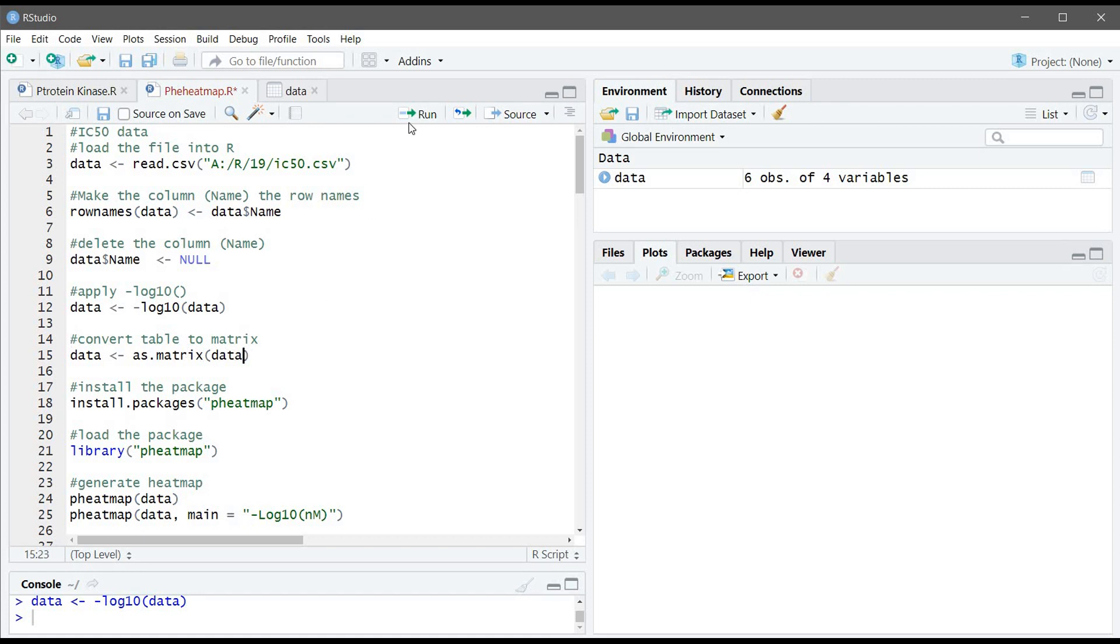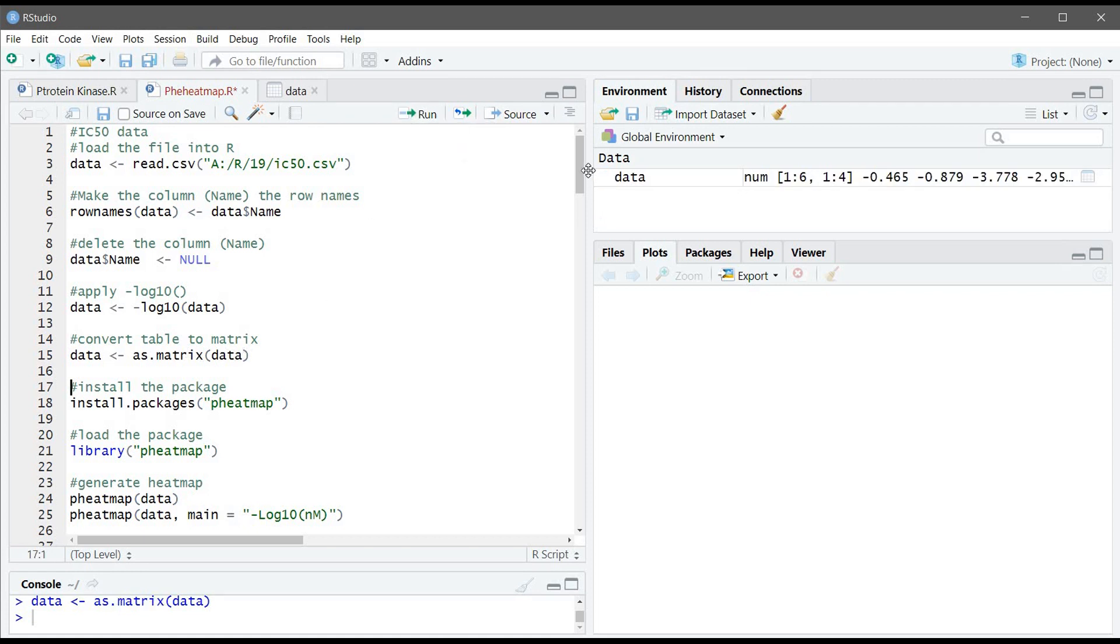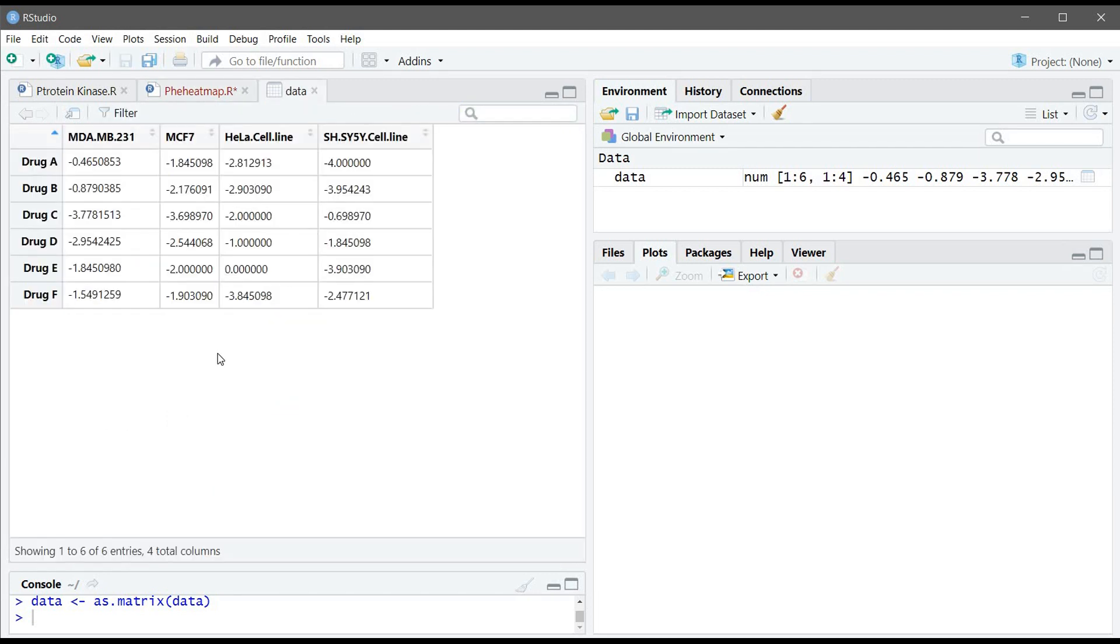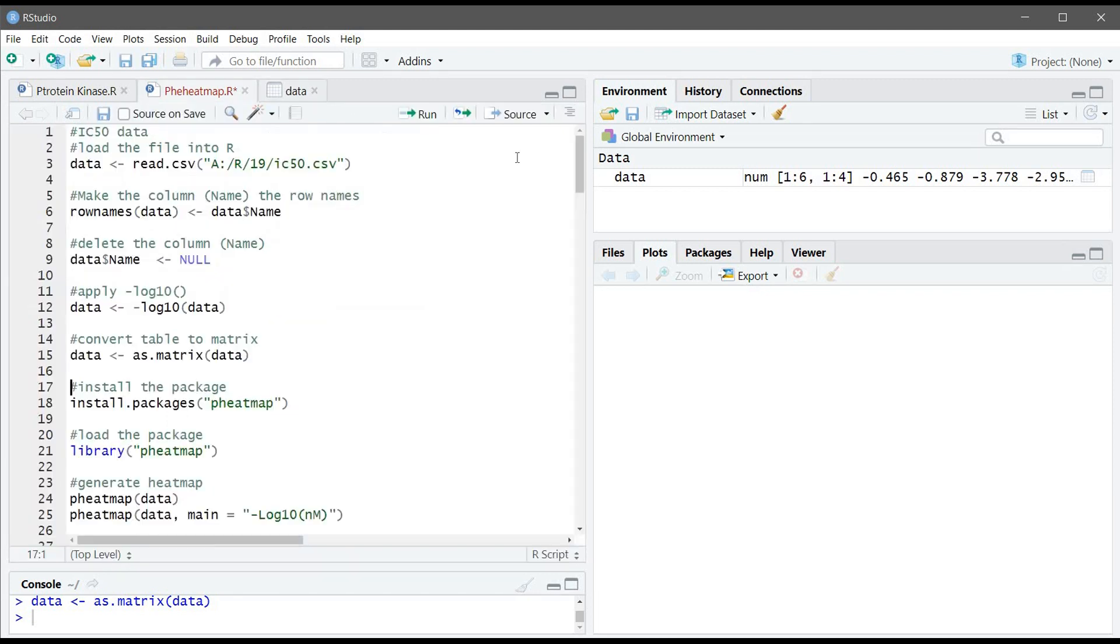So let's convert them into minus log10 and convert it to matrix. The table we will convert it into matrix. Now our table is ready for heatmap. So you will install the package pheatmap and I already installed it so I'm not going to do it. So I'm just going to load it by using the library function.